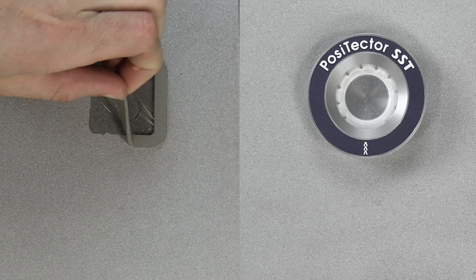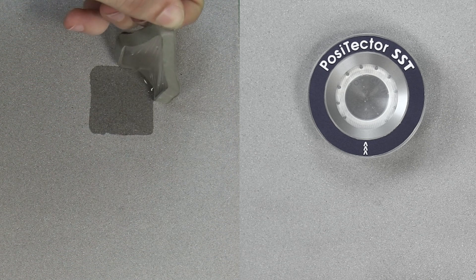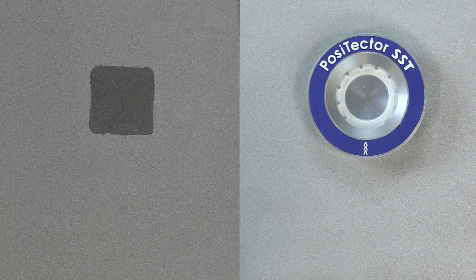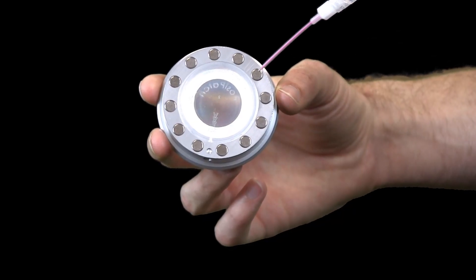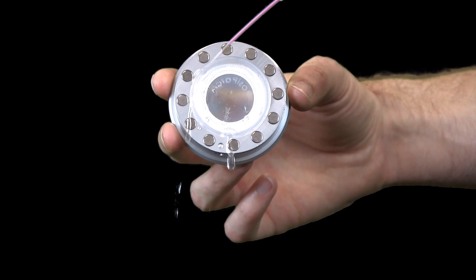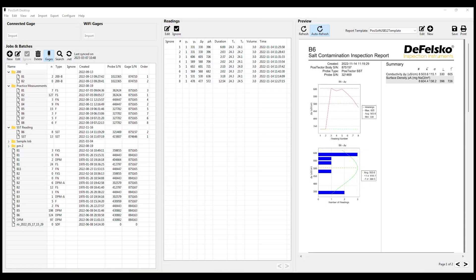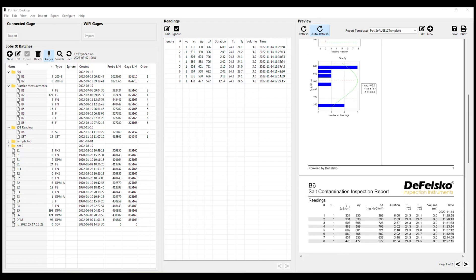The patch can now be removed from the surface. The Bresle Method DeFelsko patch peels off the surface easier and with less residue than conventional Bresle patches, and is disposed of after the test. If using the reusable magnetic PosiPatch, remove it from the surface and rinse the test chamber with DI water — it is now ready for reuse. Once a reading is saved into the PosiTector memory, PosiSoft software can manage data and create professional reports.